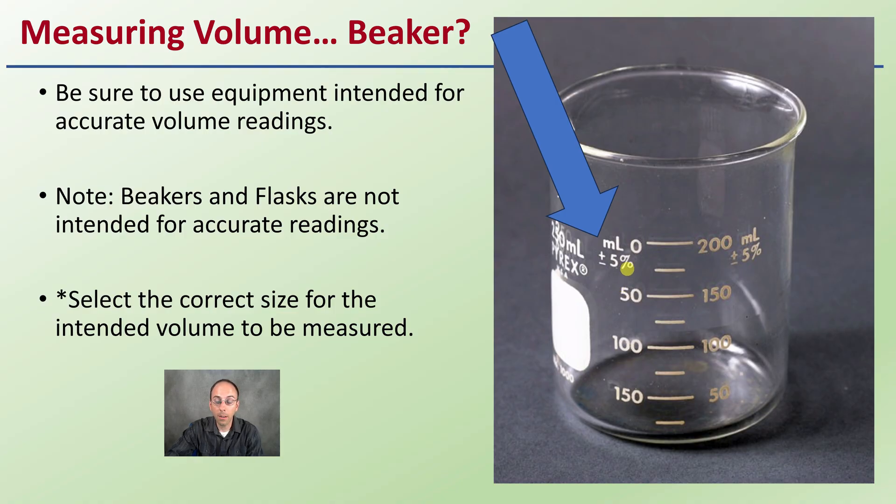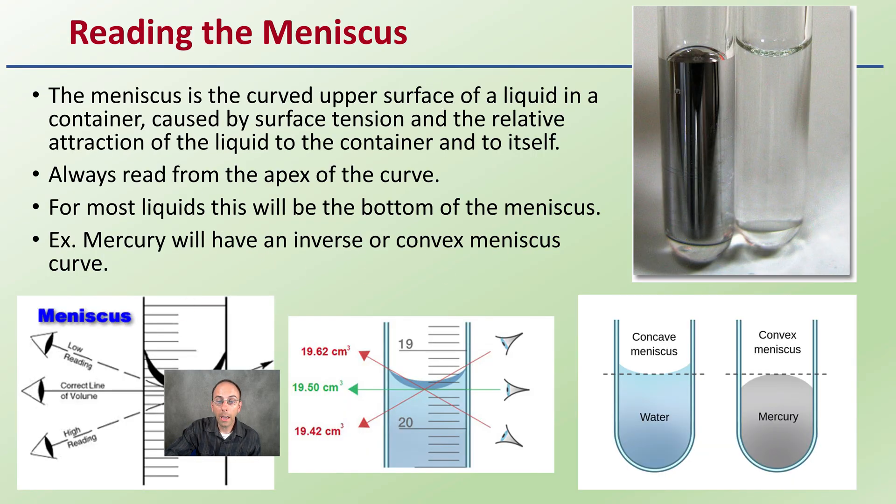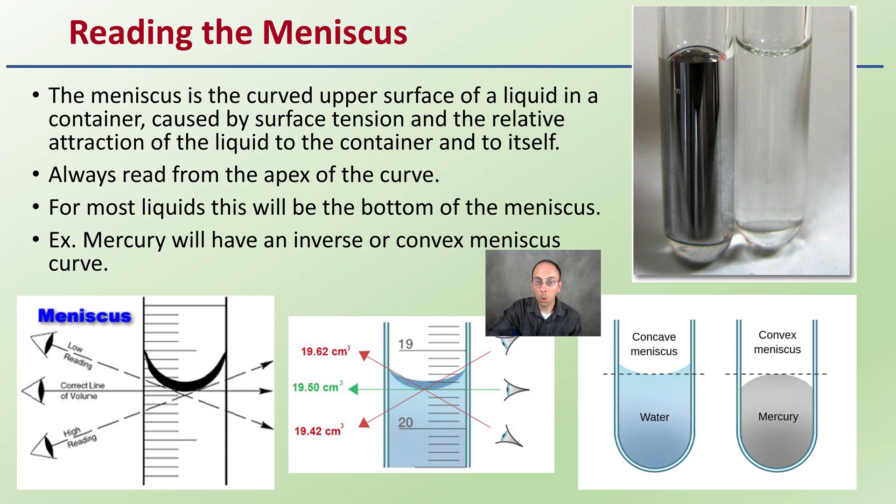The correct size for an intended volume can be measured giving you a general idea, but not something we really want to utilize to accurately measure our volumes. When we're looking at actually measuring our volumes, we should be using a graduated cylinder. That's what we should be utilizing, and we're going to see something called a meniscus.